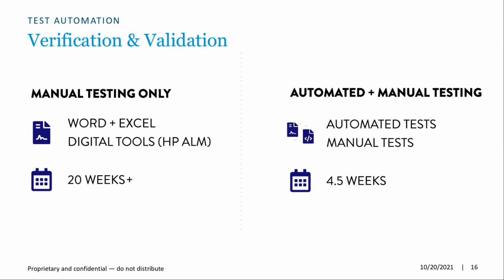That includes the testing team, myself, and the other testers running our test cases. If we find an issue, reporting those issues to our development team, the development team fixing those issues, the testing team retesting what we have already executed to verify that nothing else had been impacted by those changes, as well as to make sure that the changes did occur. All of those steps, 20 plus weeks.